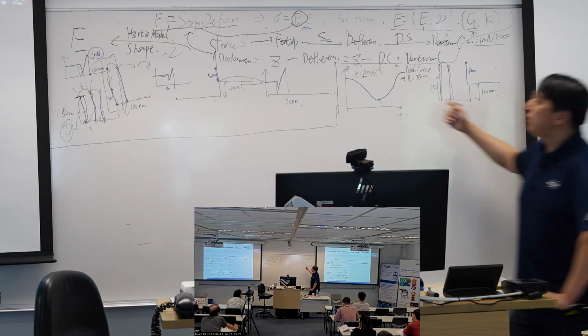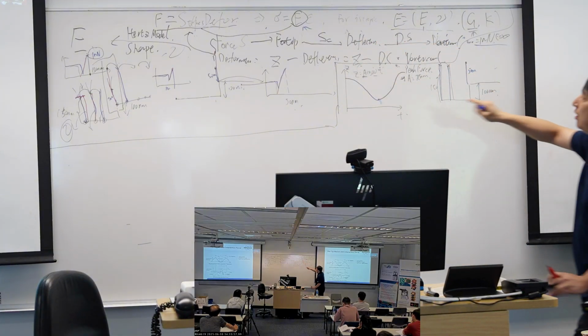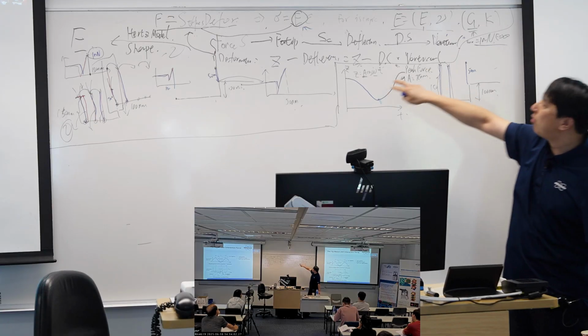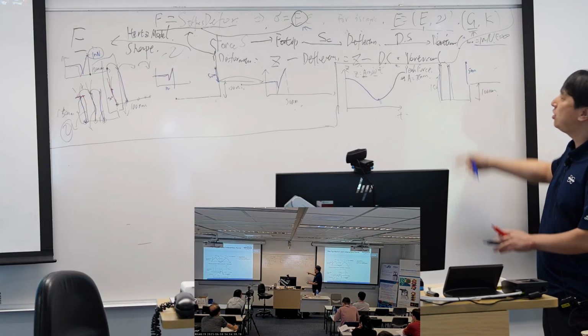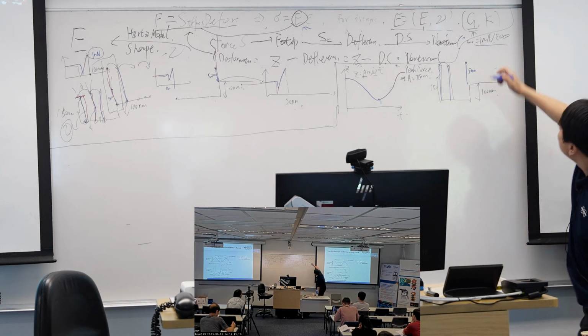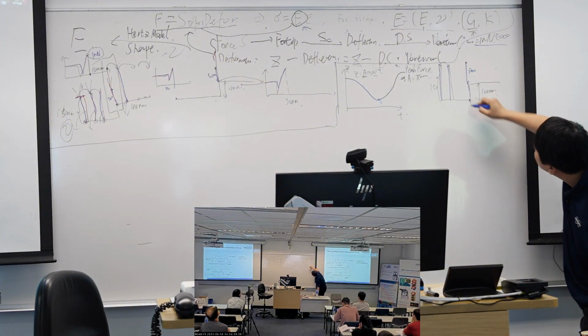According to our principle here, we want to retract, but this is a fixed sinusoidal movement. We already set the amplitude to be 75, so it cannot go back. It has to finish the 150 movement.